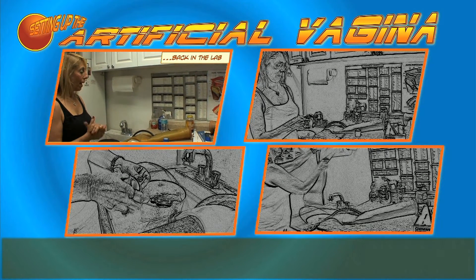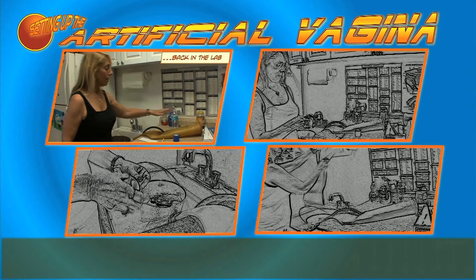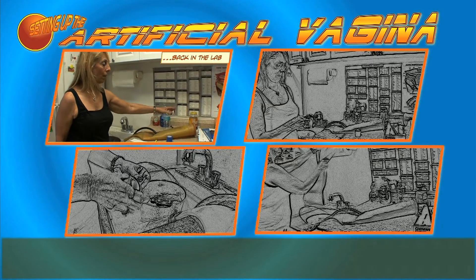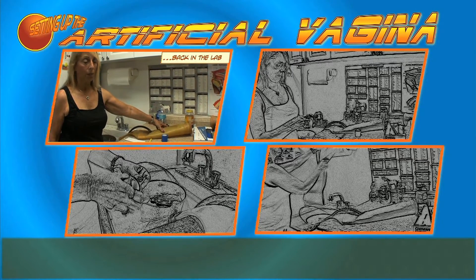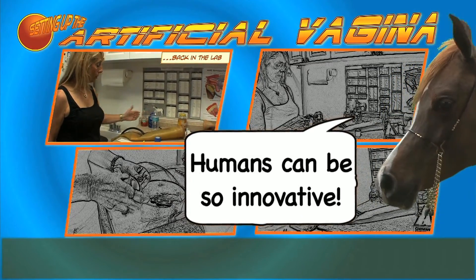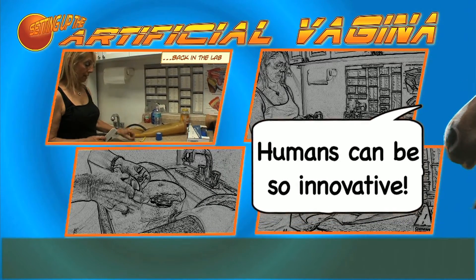We're back in the lab and next we're going to make up the AV. This is an AV. The actual name for that — what AV stands for — is artificial vagina. This is what we will put the stallion's penis in and he will ejaculate into a filter and a sterile bag.